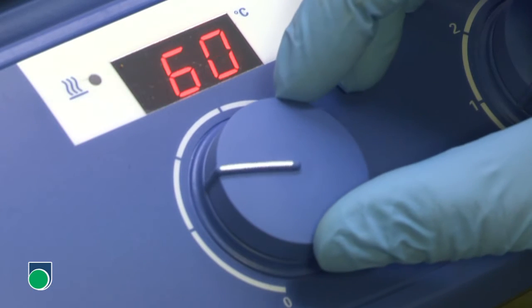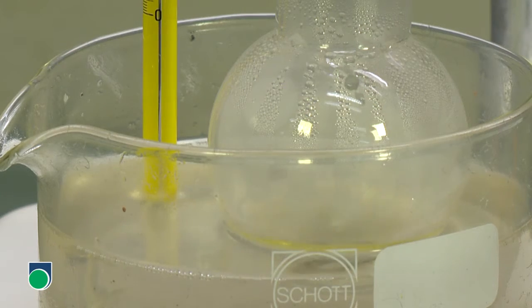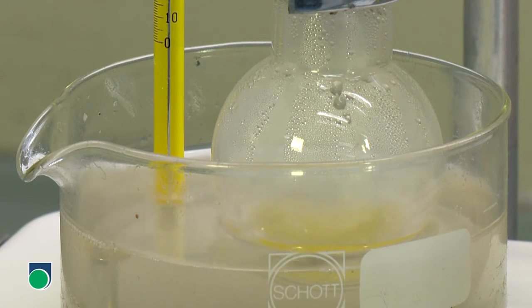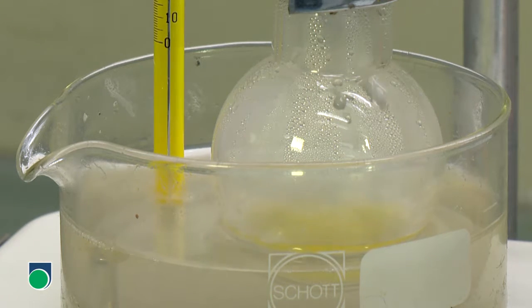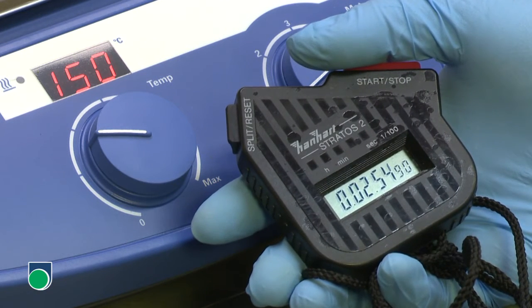Turn on the heater and adjust a suitable temperature for reflux. Notice the temperature of the oil bath. Notice the solvent vapors condensed on the inner wall of the round-bottomed flask. Record the time required for the reflux when necessary.